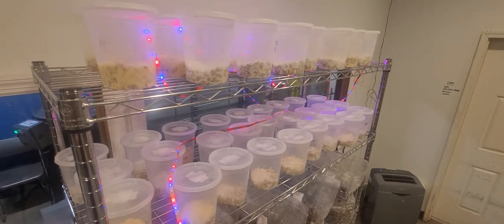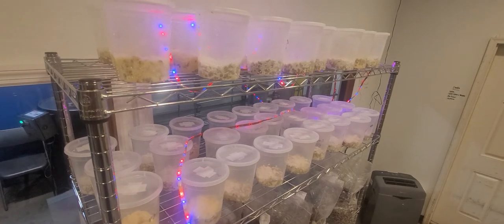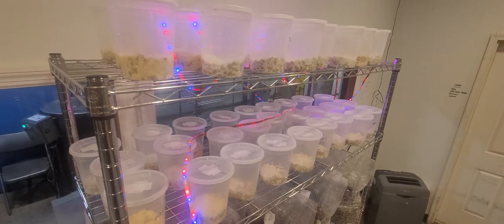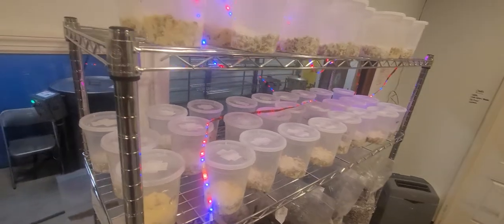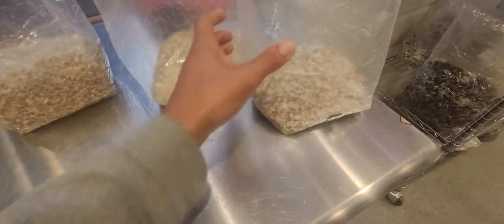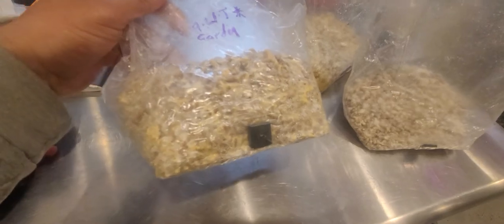Hey guys, Brandon here — I See Fungi. In some of my previous videos you saw me finding and collecting wild cordyceps mushrooms. What I did is I took a tissue sample off that cordyceps, put it on agar, made a liquid culture syringe, and then inoculated some grain bags with the liquid culture just to see how they would do — and they colonized pretty well.